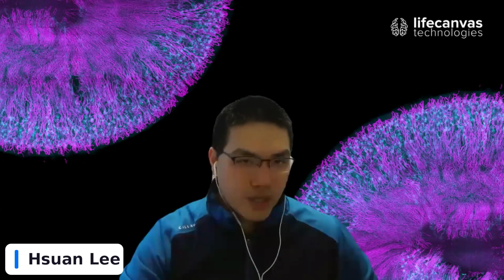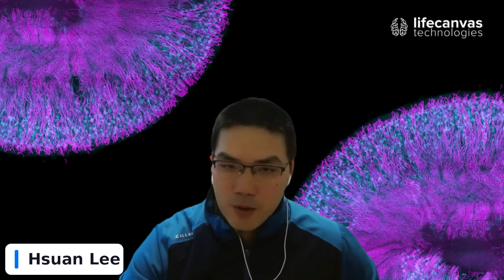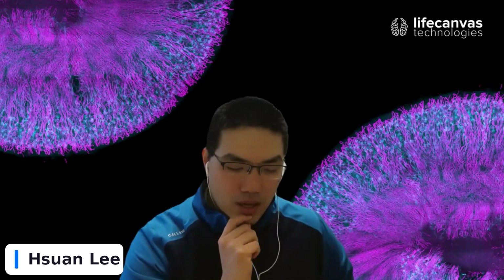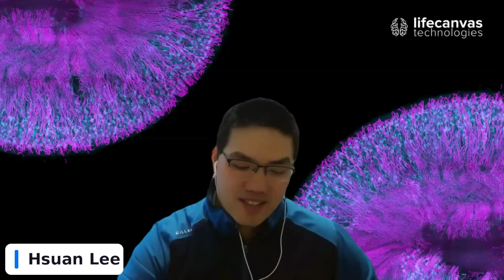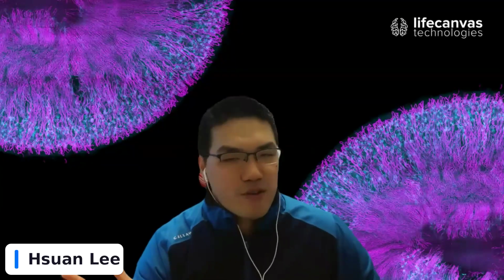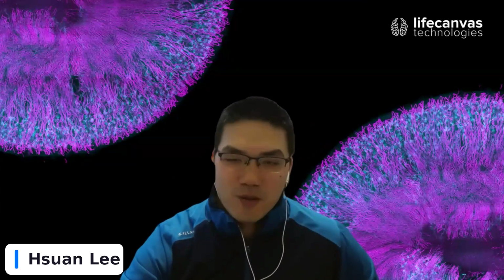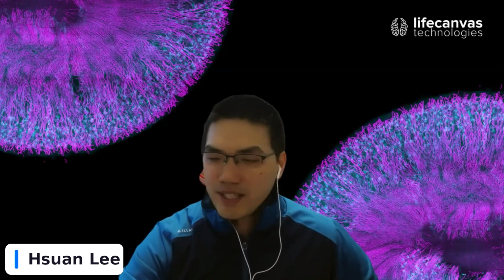And we're also actively working on improvements to make it compatible with water, because I know some people want to image maybe expanded tissues or live organoids as well. By the way, for live imaging, the imageable sample depth is going to be limited by scattering. So maybe you can image up to 100 microns-ish, depending on the density of the samples. But after a certain thickness, you still need to clear it for better penetration and also better labeling afterwards.